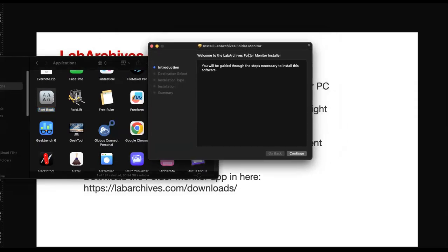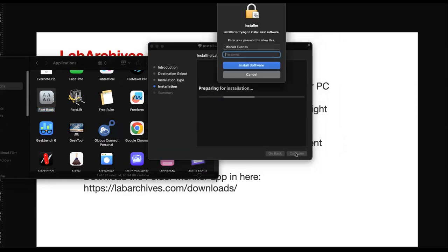Okay. This is what you download from LabArchives, and I'm going to install it.